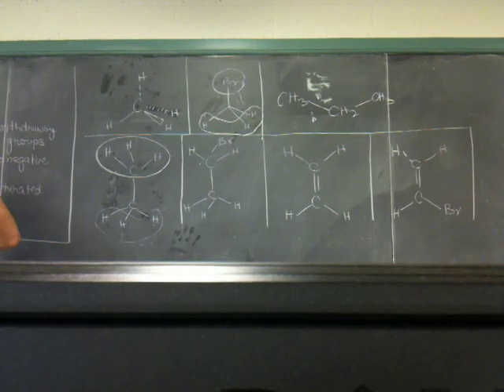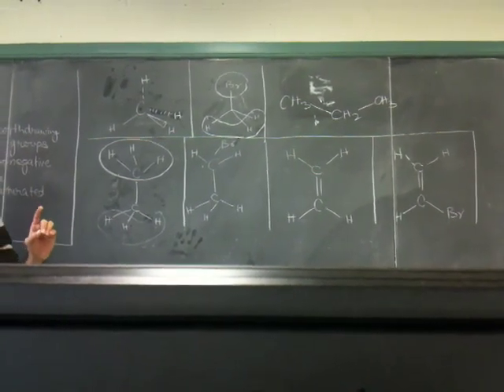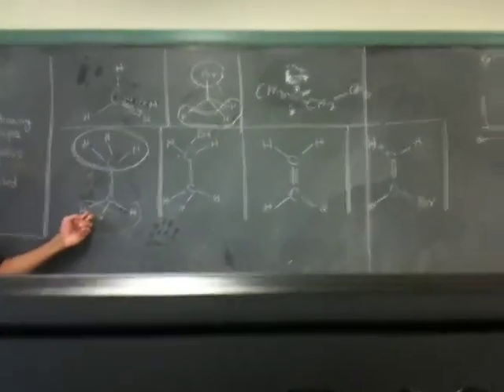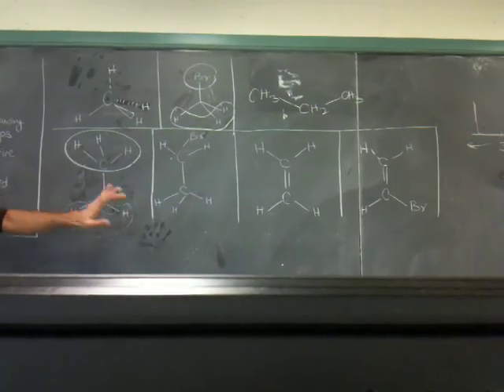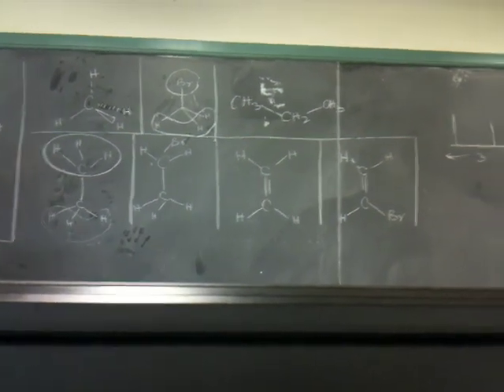Now consider this half of the molecule. I would like to make clear that we are just talking about the proton NMR, so whatever peak we get is for the proton, that is H here. We will get one peak for this because these are one set of protons feeling identical forces, and hence these are in the same chemical environment.